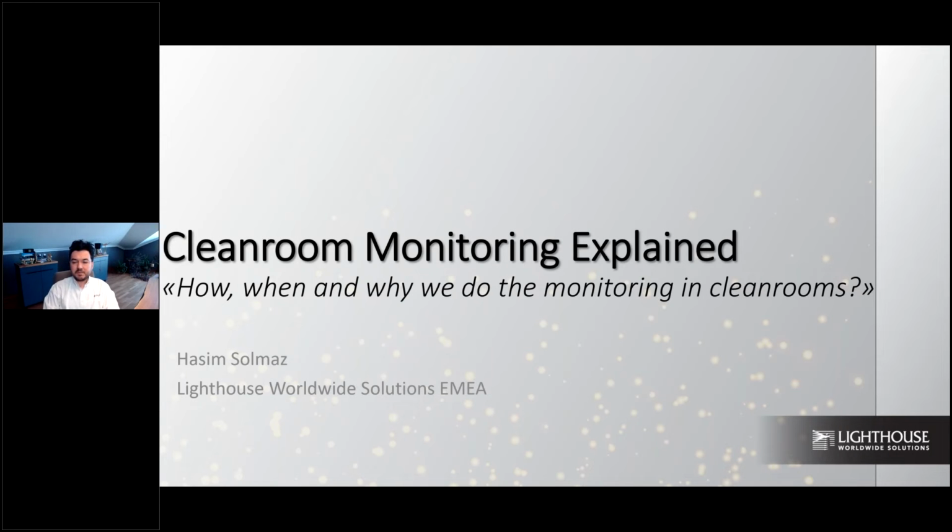Hello, welcome everyone. Today we'll be talking about cleanroom monitoring and the reason that we're using monitoring systems in our cleanrooms, especially the particle monitoring systems. But we will also mention microbiological activities, especially active sampling technologies, and how, when, and why we do the monitoring in our cleanrooms.